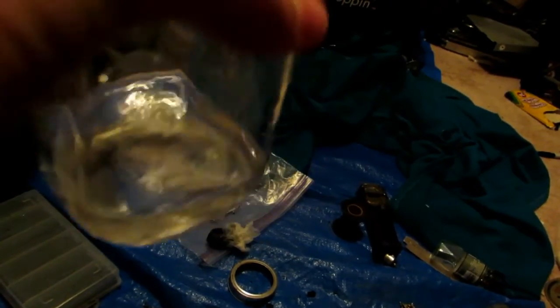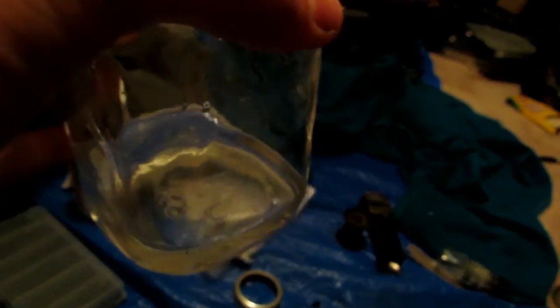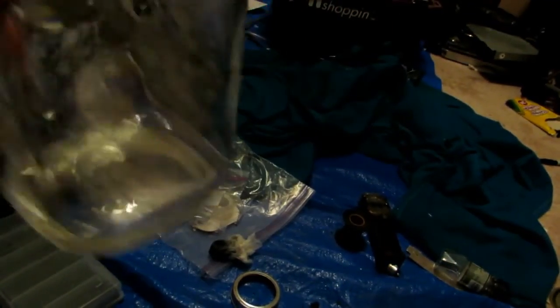After filtering, we have a beautifully clear solution of hopefully potassium carbonate. I'm going to boil off all the water until we're left with a powder. I may transfer this to another container besides this glass jar, as it might be slightly difficult to get the potassium carbonate out afterward. Nonetheless, I'm going to boil it down.